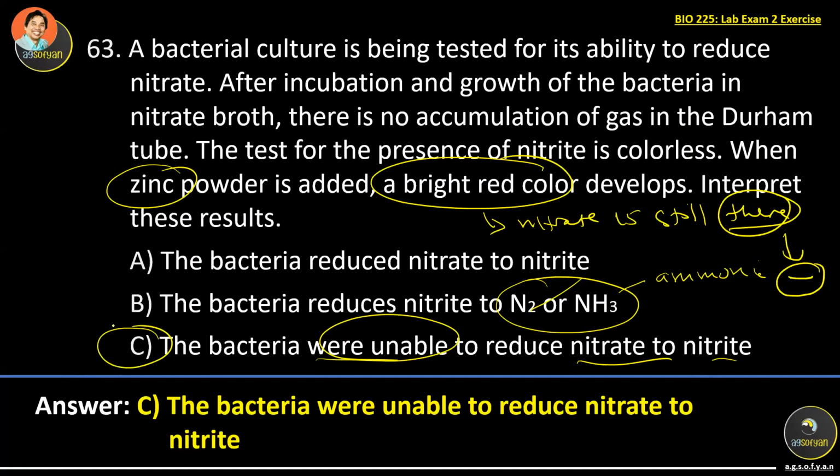This is a similar question to before: a bright red color after zinc means negative.